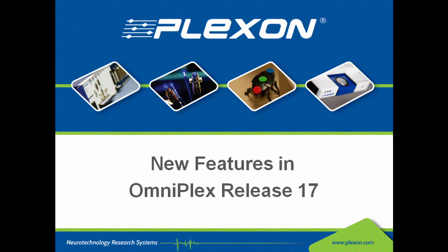Welcome to an introduction to some of the new features in Release 17, the latest software for all OmniPlex systems.